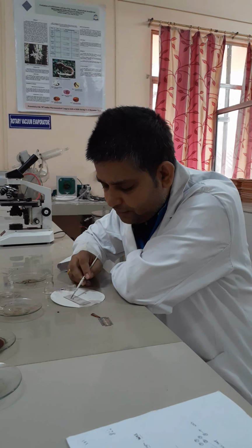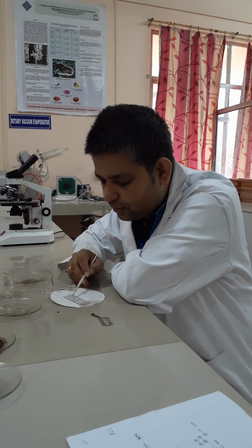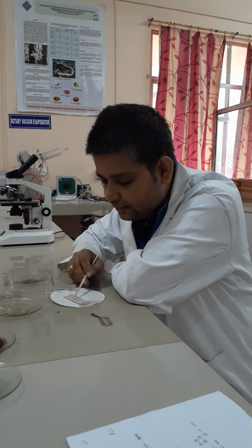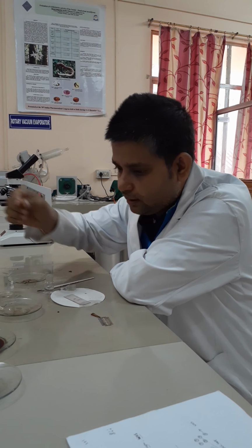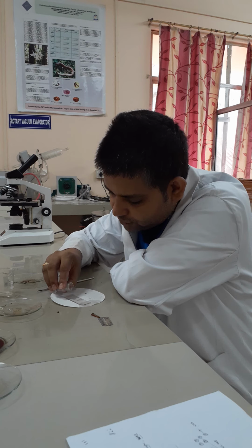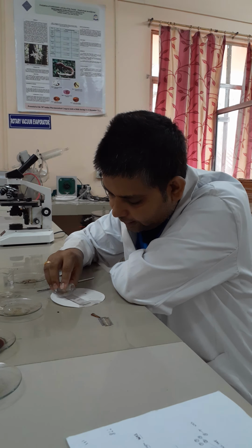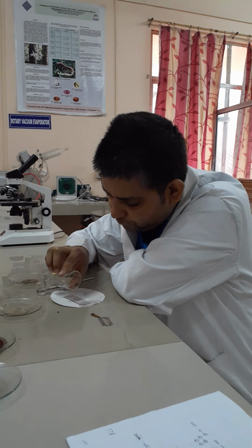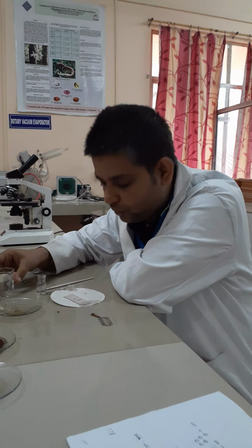Just wait for some time and mix the chloral hydrate solution with the section properly so that all these things go away. After that, you add 1 or 2 drops of phloroglucinol and add 1 or 2 drops of concentrated hydrochloric acid.